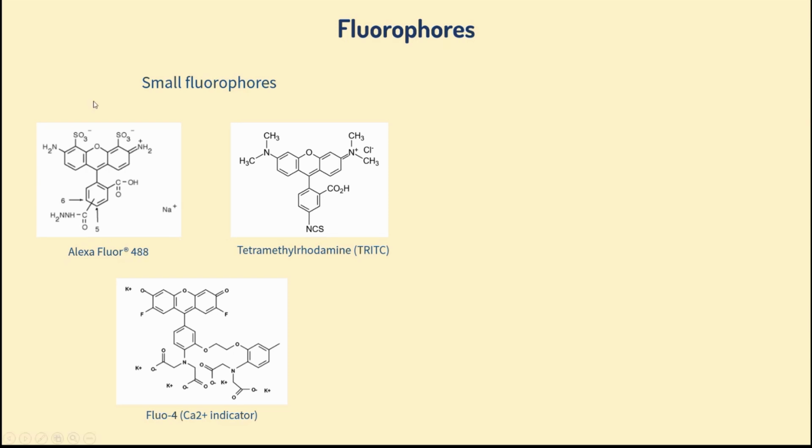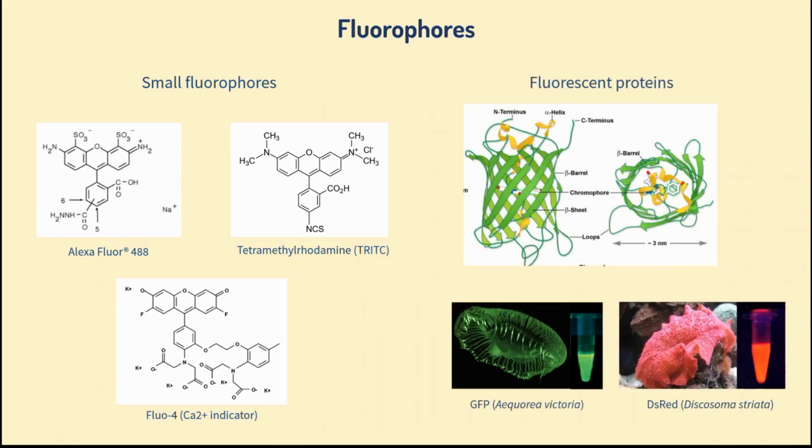This makes a good resonance system, and this is how the fluorophores work. So the photons will excite the electrons here that are at the lower energy level because they are very comfortable in these resonance systems, and then when they relax, they will emit the fluorescence. We will explain this with the diagram down below.